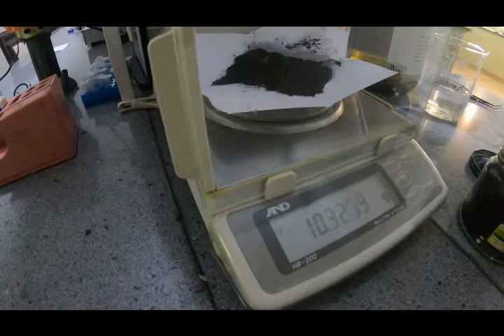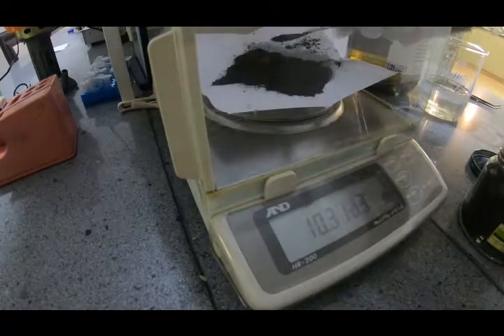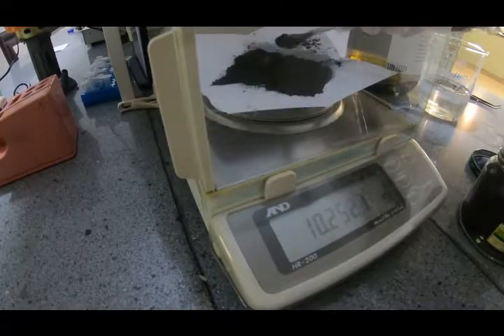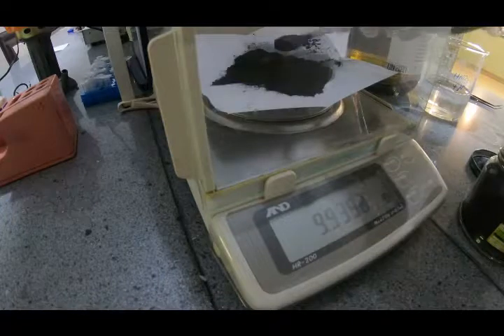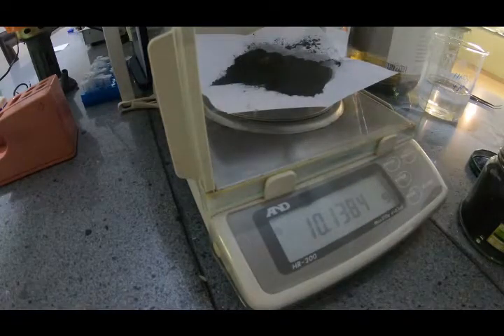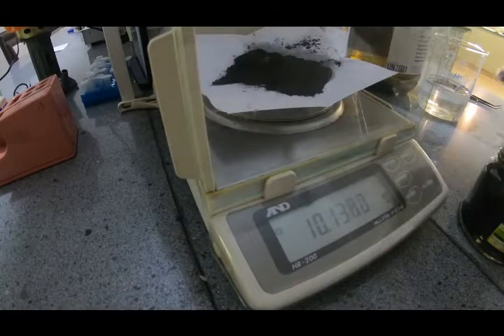Okay, that should be enough. Let's do a little bit of it. Just be careful and don't breathe this stuff. It can harm your lungs.